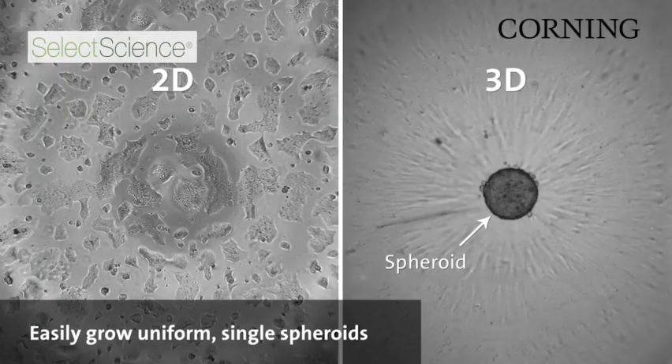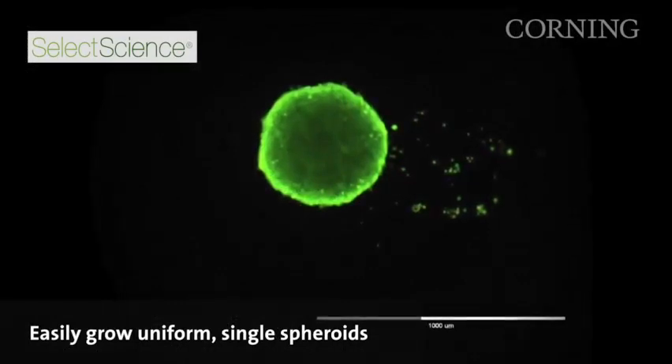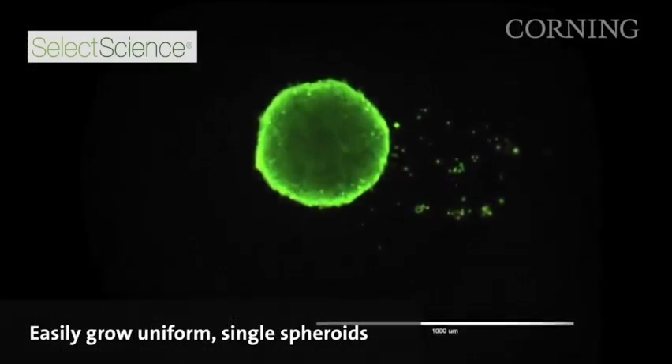The round bottom that is included with the plates also allows the cells to form into a single consistent spheroid from well to well, which makes the data that is generated from these types of plates very reproducible and very robust.